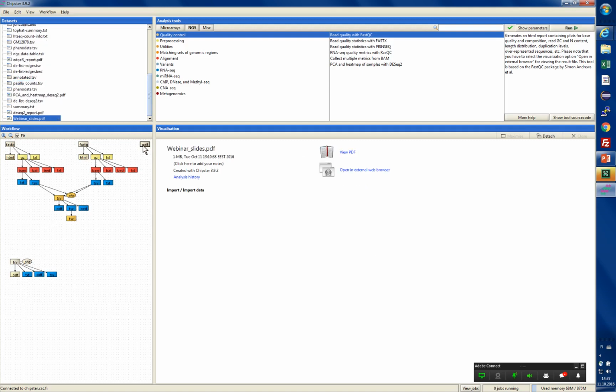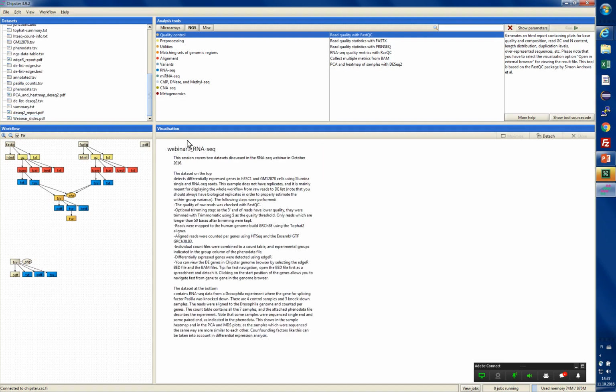And finally, there is one lonely PDF file here. This is actually the slides that we are showing now. So if you go to example sessions and select this one, you will also see the slides there. But now Maria will talk about the quality control.